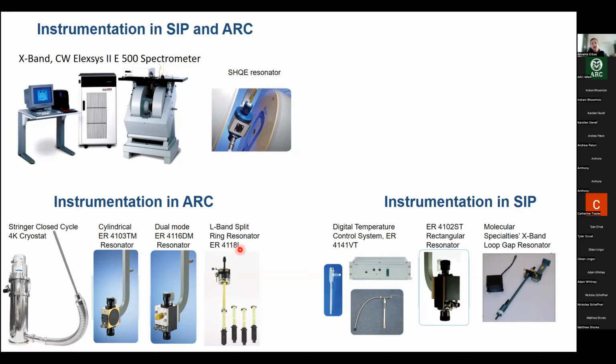And in addition, you guys have an L-band resonator that's, if I understood this right, brand new. And that goes together with a different bridge, L-band, because L-band is lower energy than X-band. And that can be an advantage if you're working with samples that have a high dielectric constant.